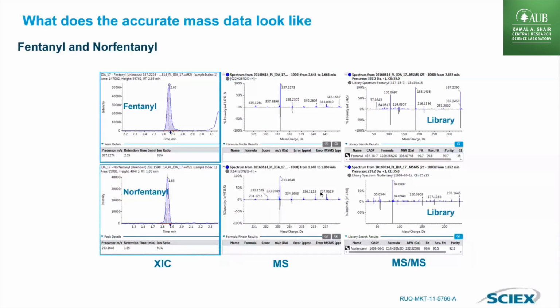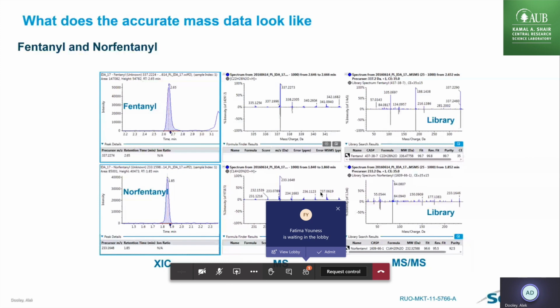This is what the MSMS data looks like. Actually, it's presented to you here as part of a whole experiment. So we see the XIC on the left side. This is the data that we just talked about from the MS scan. Here is the MS scan in the middle. Do you see the red line? That red line is the time point where the mass spectrum is taken from. The blue is the mass spectrum of the data, and underneath it you have the isotope pattern of the calculated formula which this matches to.